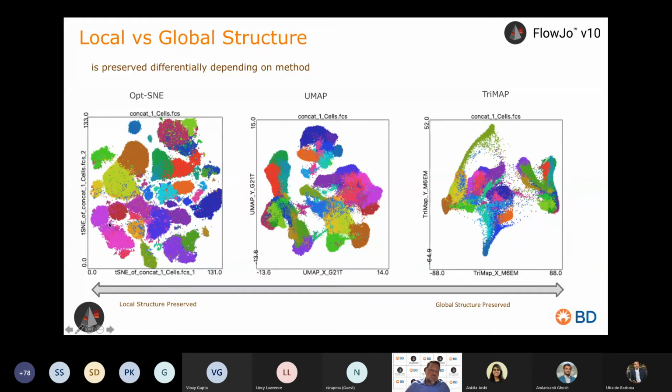And these islands are actually not related. Just because they have the same colors doesn't mean they're the same. There are only so many colors within the color palette to apply, so you get this smattering of different colors, but each color does represent a distinct population that came out of phenograph. In this case, I ran phenograph, and now we're looking at the overlay of those clusters with distinct populations represented by the different colors.